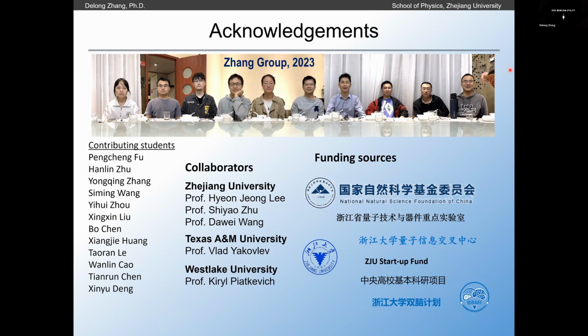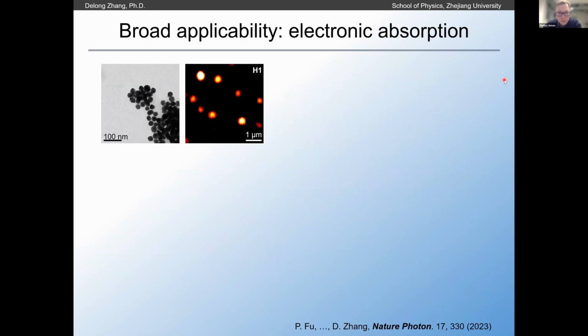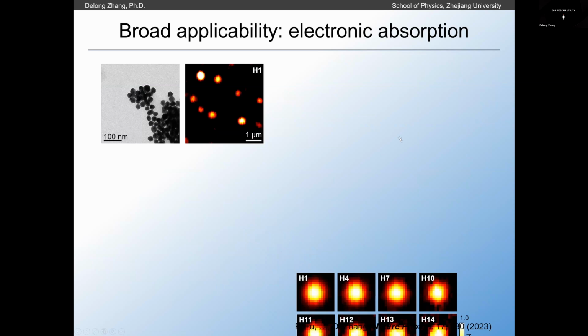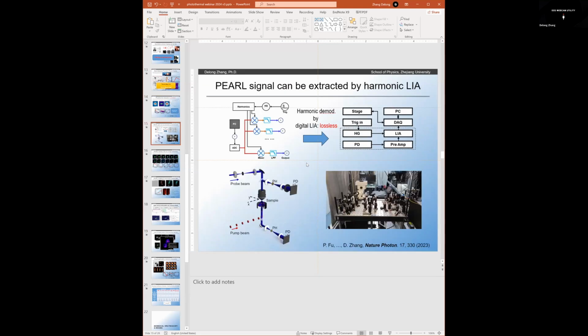Hi, thank you. Yes. I was wondering about the higher harmonics and also the 8th order and 10th order. Do you excite with a sine wave or with a square wave so that you can get the higher harmonics? The excitation, yeah, the profile in time of the excitation light. I mean, if you use a single sine wave for excitation, you just have the first order harmonics, because the second order harmonics will give you a 0.